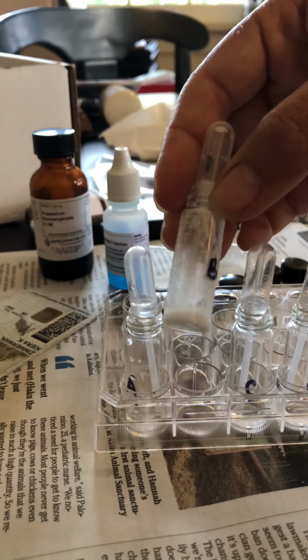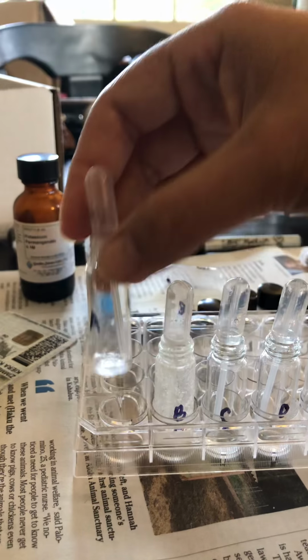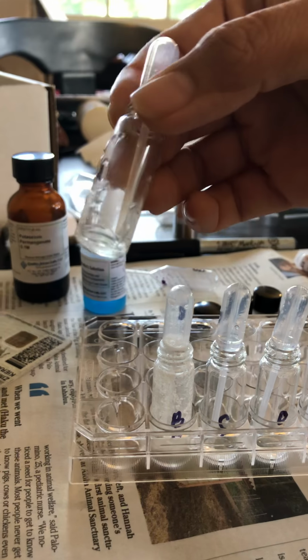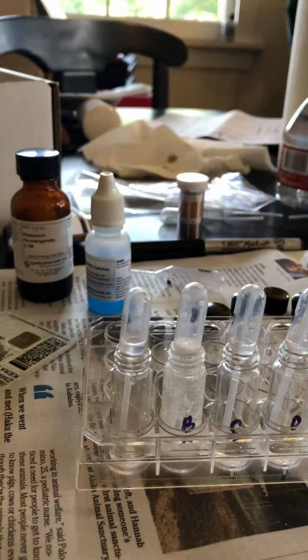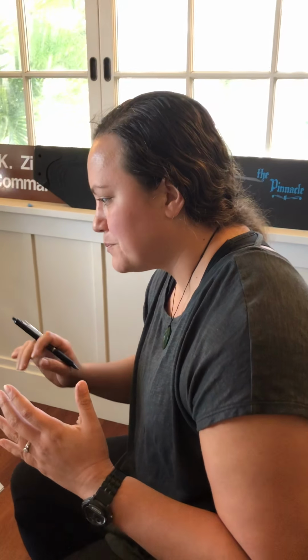In the end, I figured out that caffeine is mildly soluble and thymol is not soluble at all. Because B had this white milky stuff, I had a really hard time getting it to mix in. And although A does have some crystals in there, the crystals did shrink in size and some of it did actually solubilize. So I chose caffeine for A and thymol for B.